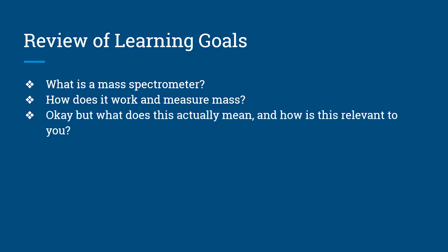And we learned that this invention has aided science and humanity for the last century in scientific advancement and survival of said species, with mass spectrometry being applied to environmental issues such as contaminants that have been identified and eradicated. This invention has led to the evolutionary advancements in the scientific community and humanity at large.